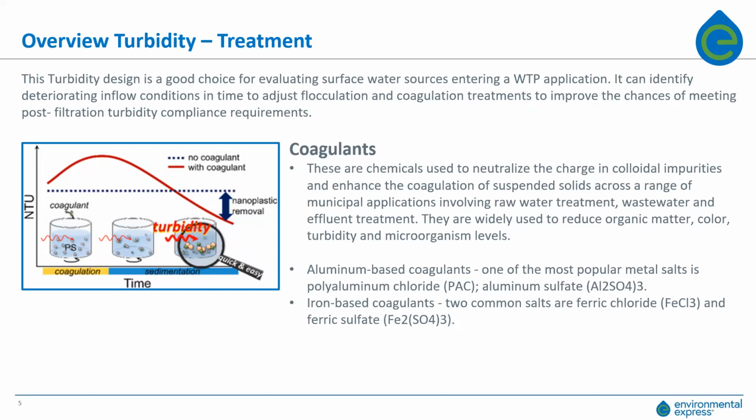I also wanted to point out the graphic on the left side of this slide, and specifically to compare a no coagulant treatment water flow versus a flow that has a coagulant added. Initially, you'll see a small spike in the NTU value, the turbidity value, and then as the floc or colloids begin to form in a clarifying tank and settle to the bottom of that tank, the NTU level will be decreased dramatically.